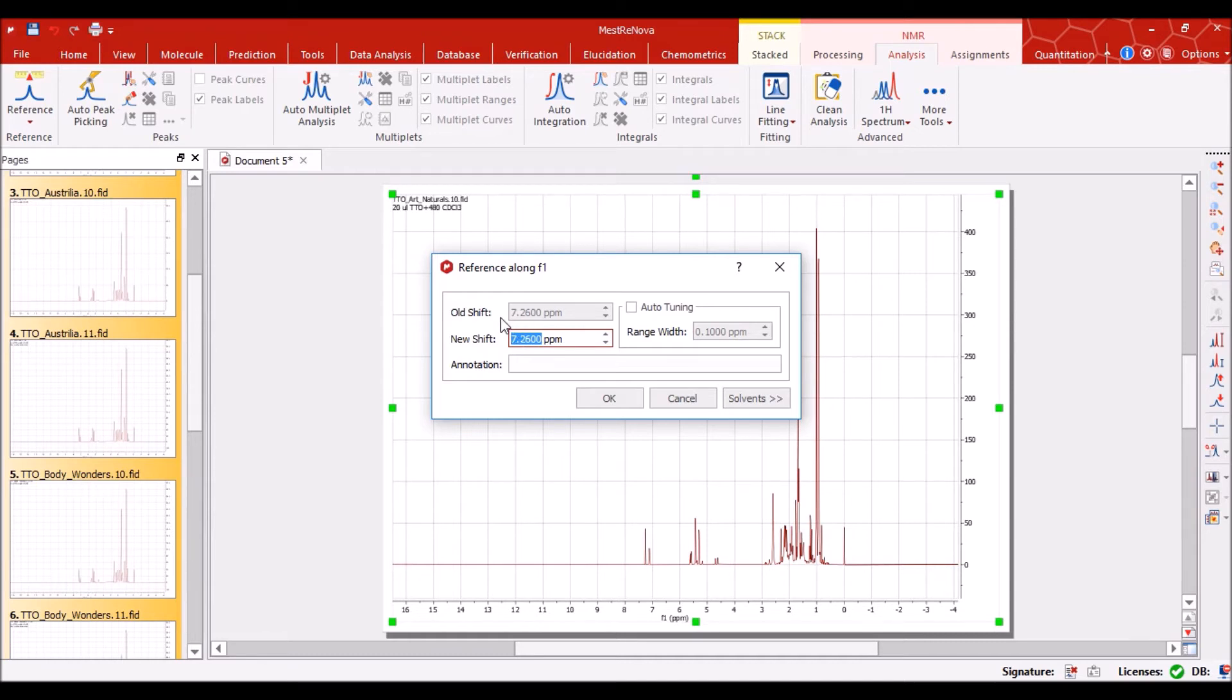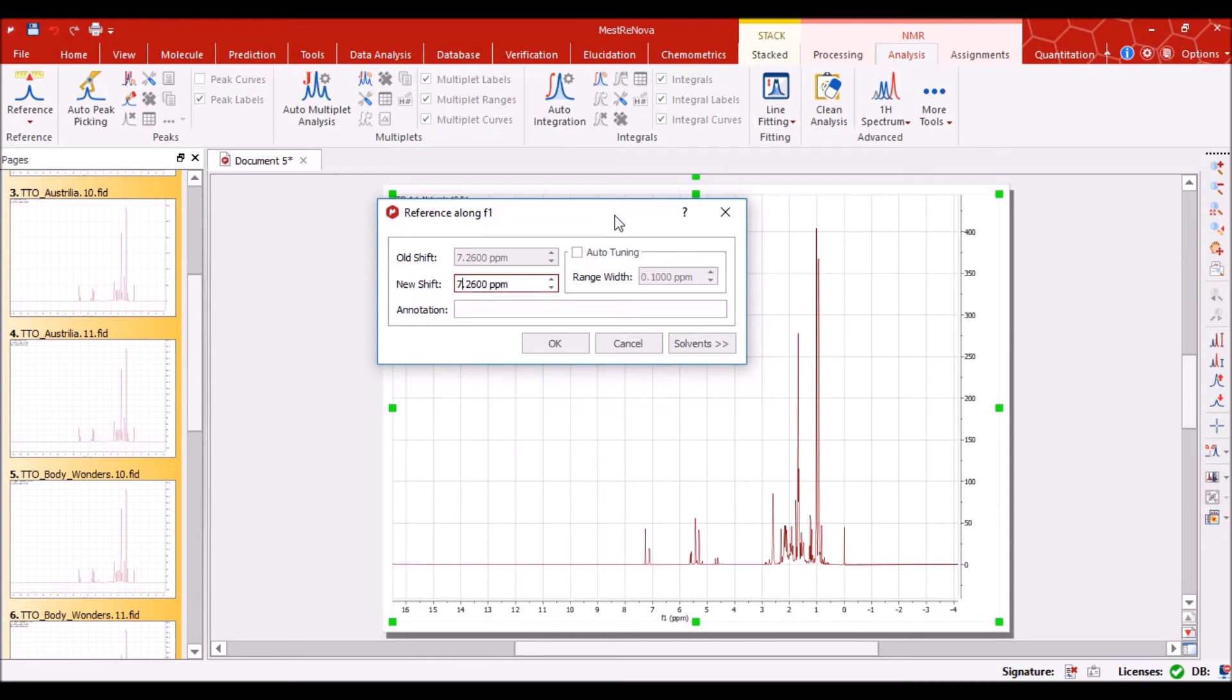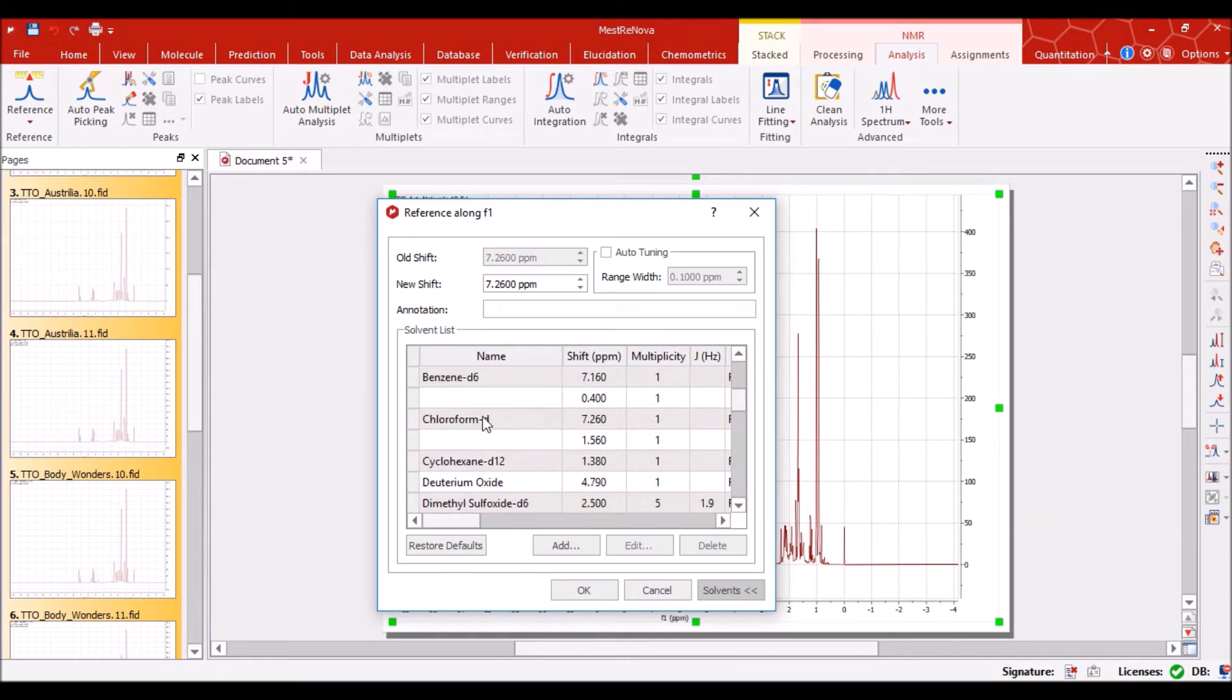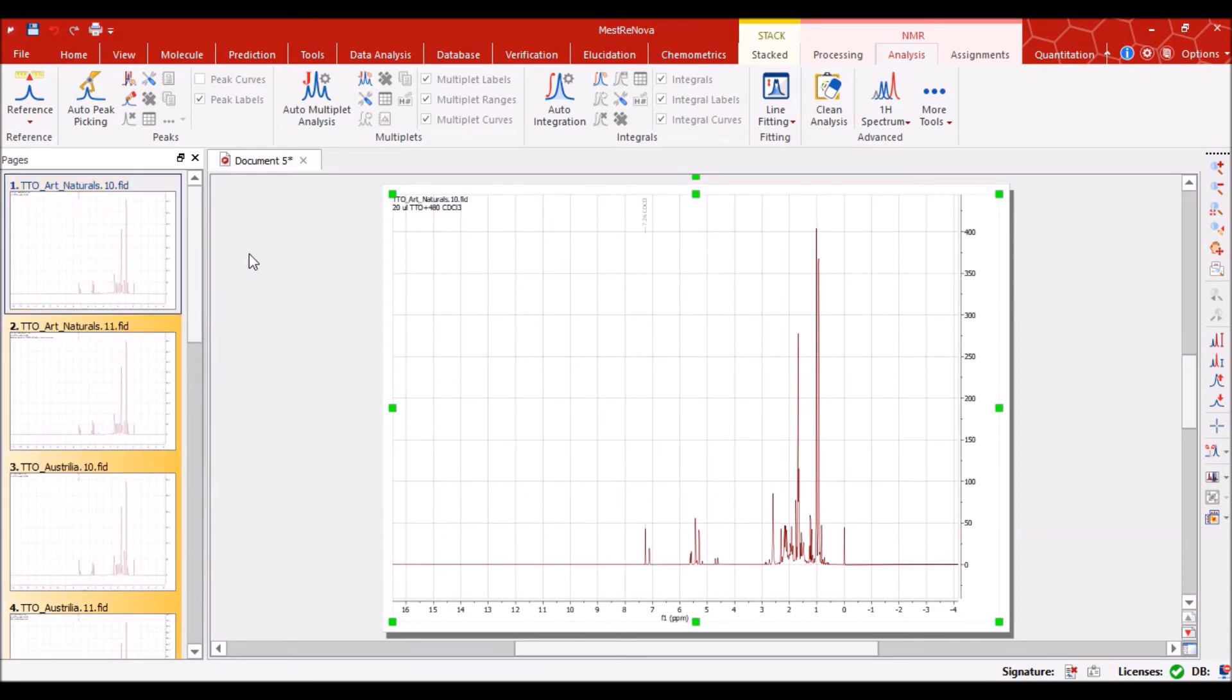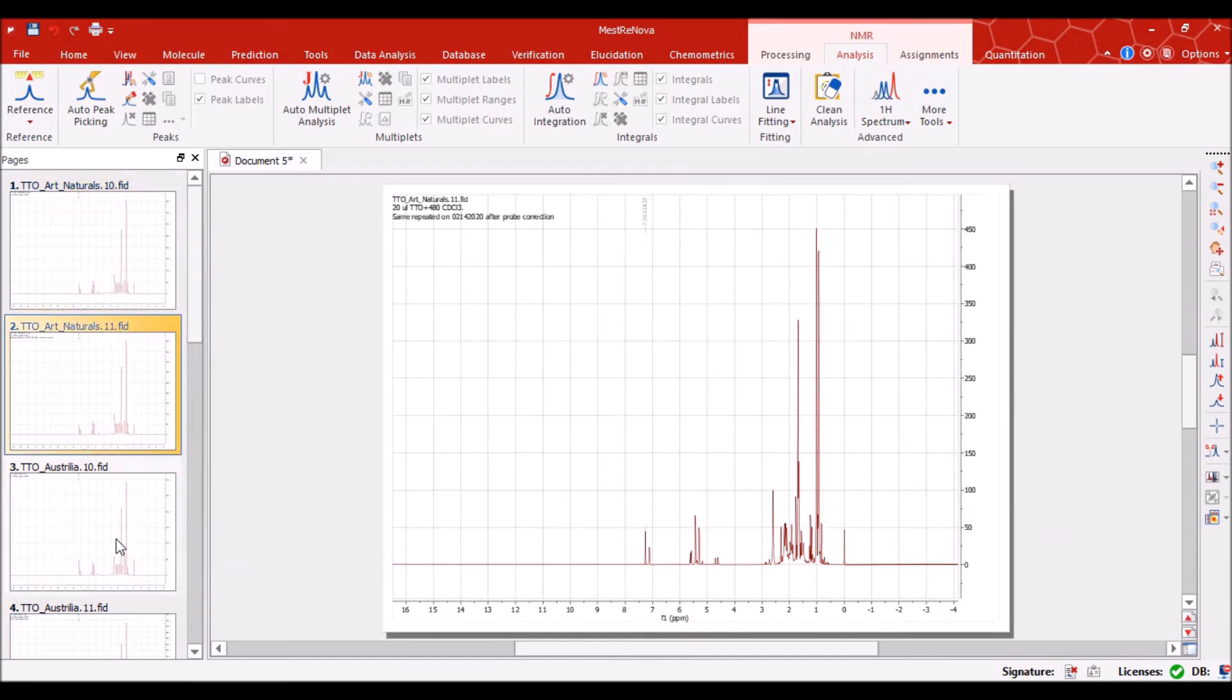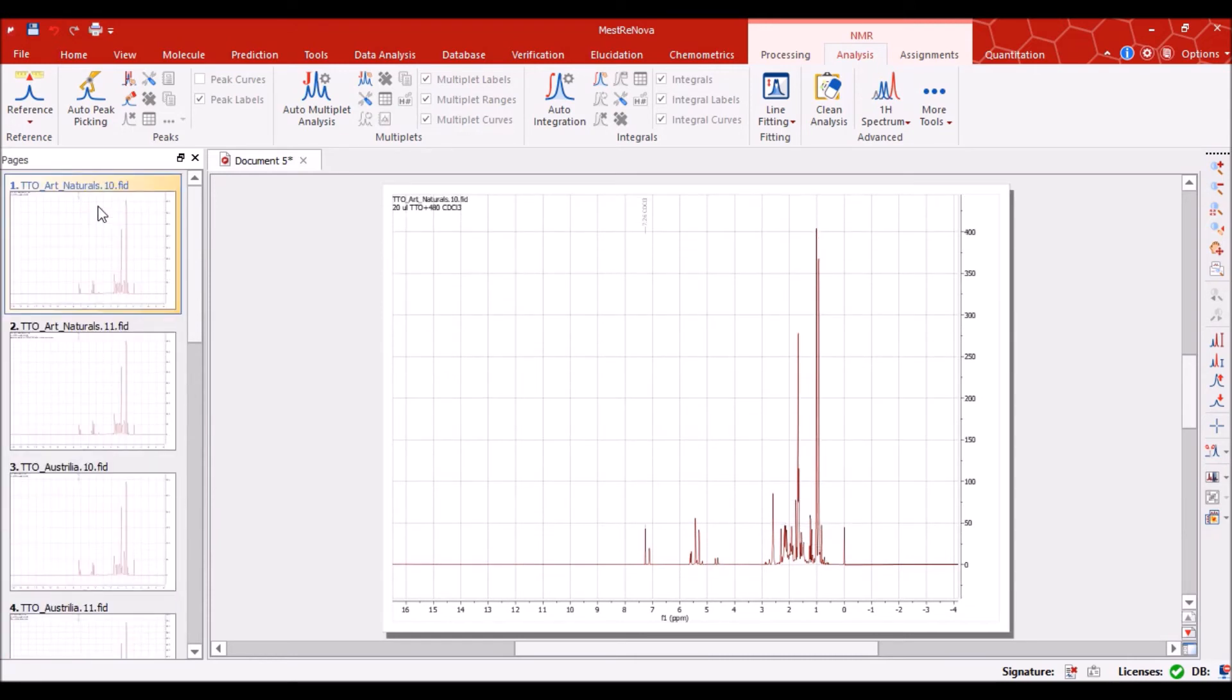We can see here that this is the old shift mentioned here, it is 7.26 because I have already did this job. So anyway, if it's let's suppose 5.26 then we can simply change it to 7.26. If we don't know about the peak of this solvent then we can click here on this solvents and select the desired solvent which is the chloroform D, CDCl3, 7.26 ppm and we just do okay. It will select this peak and all of these selected spectra. Still I would recommend you to look at each individual spectra at least to confirm it because any mishap here will result in a problem in your multivariate data analysis.